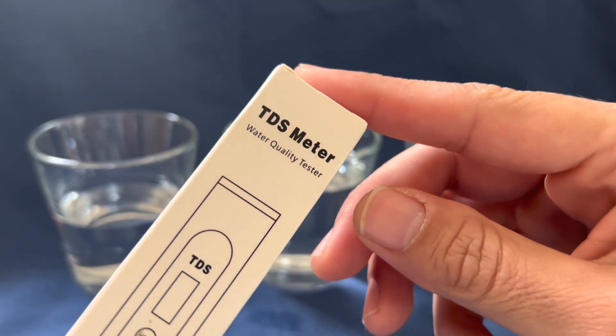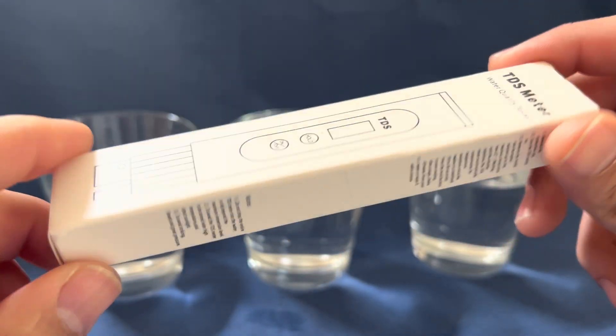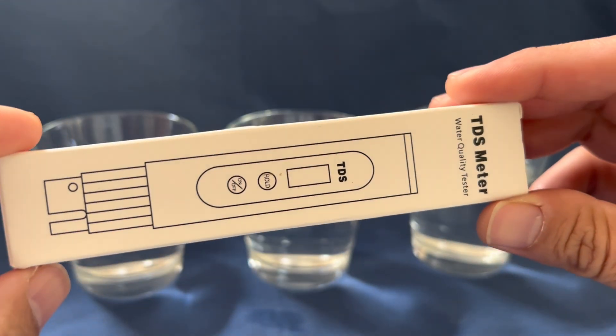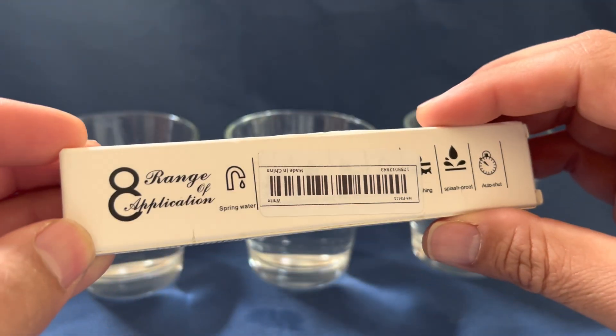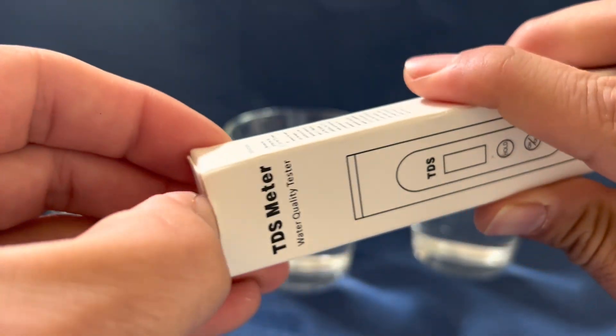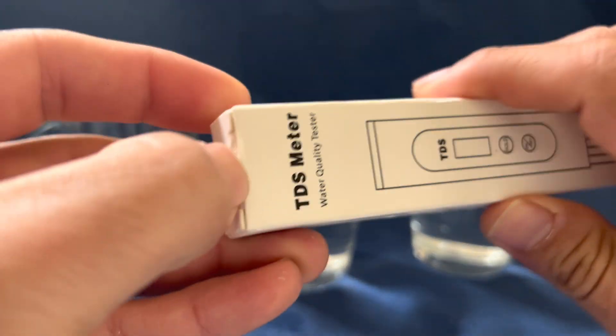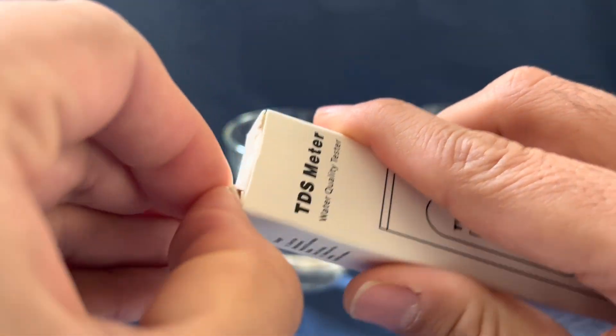I purchased this total dissolved solids meter from Temu.com and I just want to do a quick review on it. It came within the allotted time. The interesting thing about this company is that it's sending its stuff directly from China and then shipped locally.